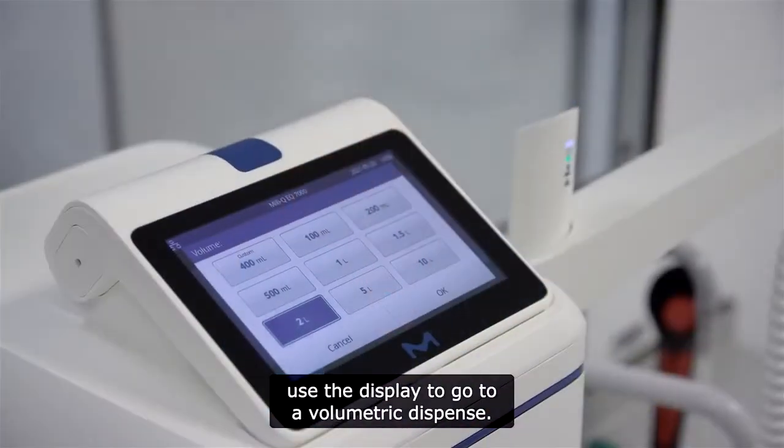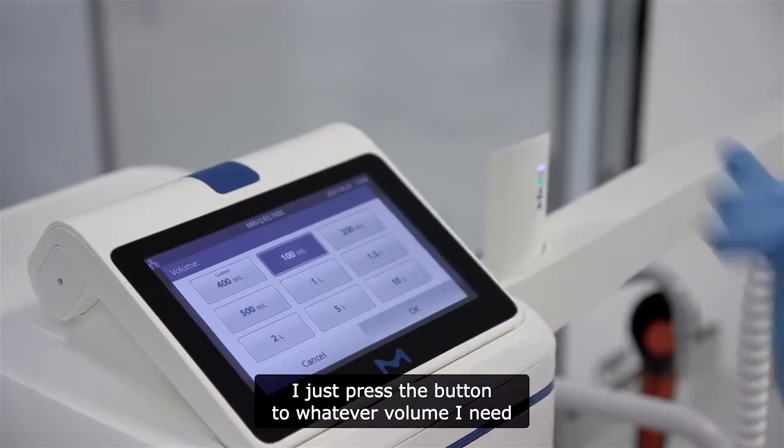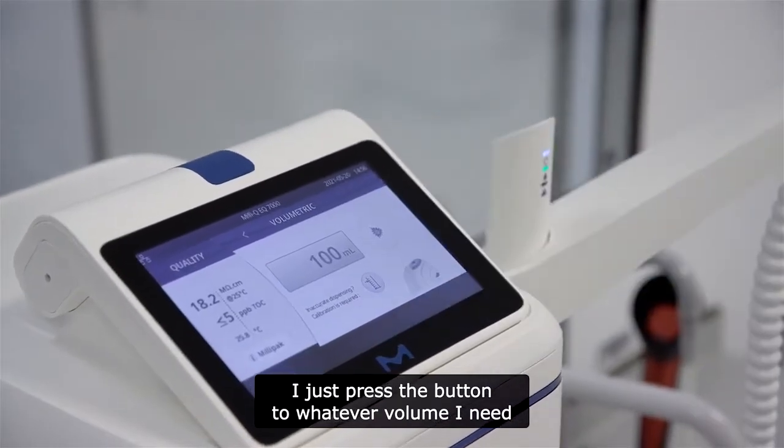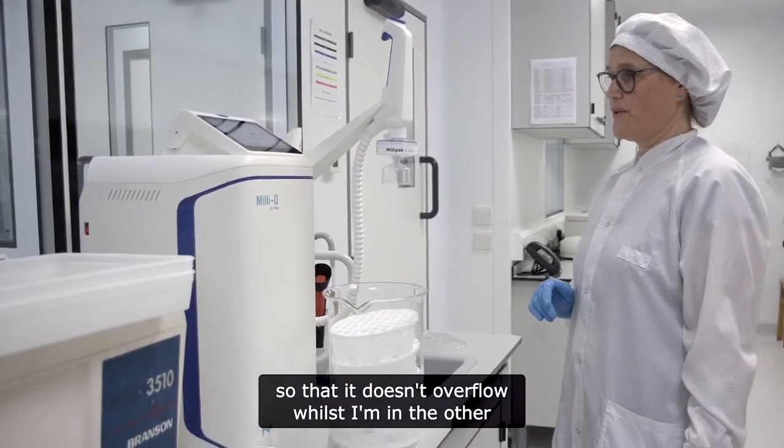If I'm really in a hurry and need to do something else in the meantime, I just place the container there and use the display to go to volumetric dispense. I press the button to set whatever volume I need, so it doesn't overflow while I'm on the other side of the lab.